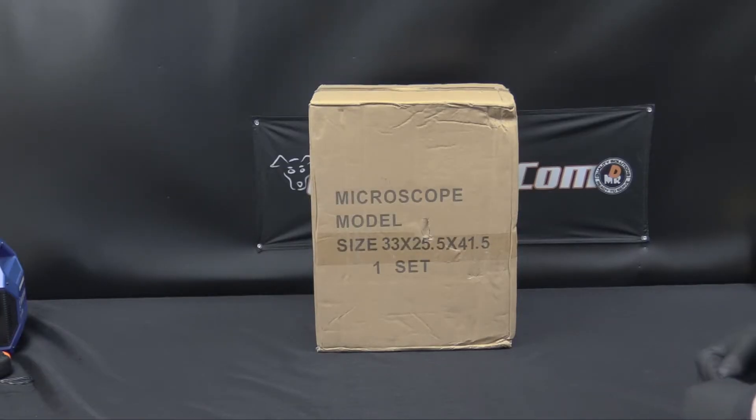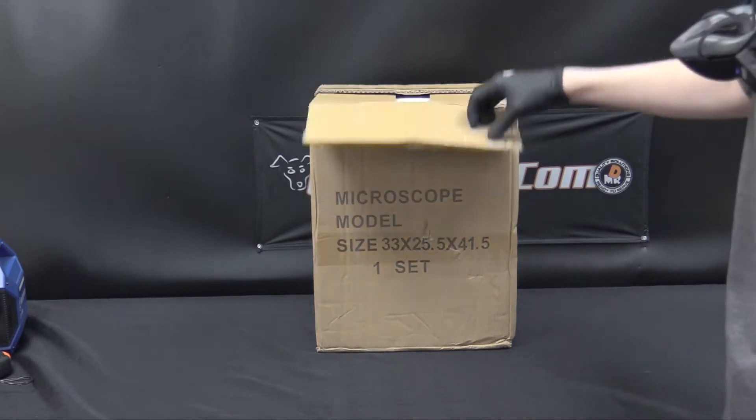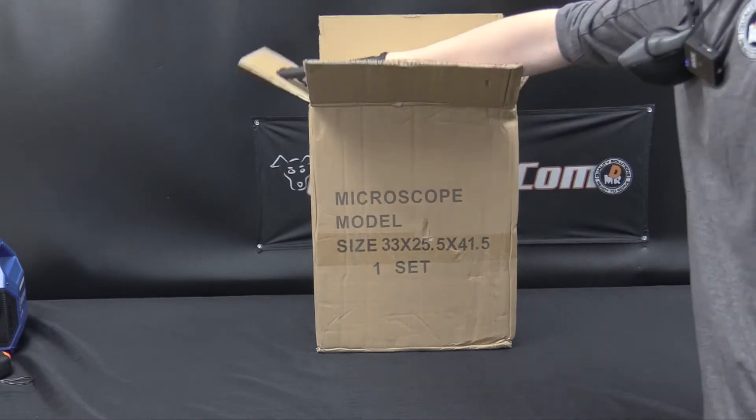Hi and welcome again to K9P4.com. Today we're going to be going through the setup and unboxing of your dual view microscope. Your microscope will come in a box like this and we're just going to go ahead and get all the items out and show you how to get it set up.